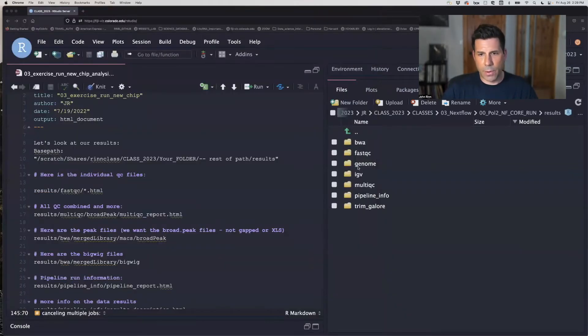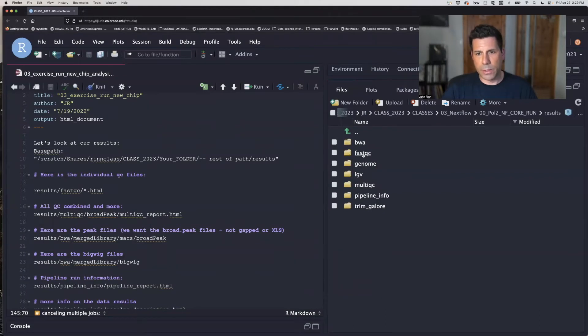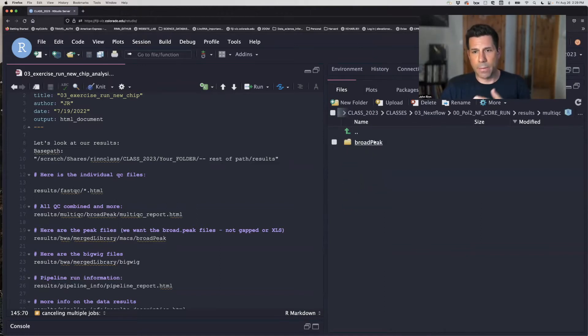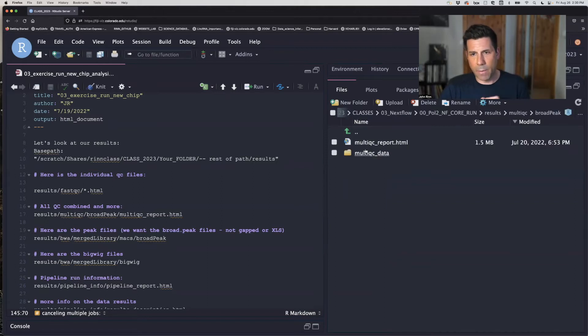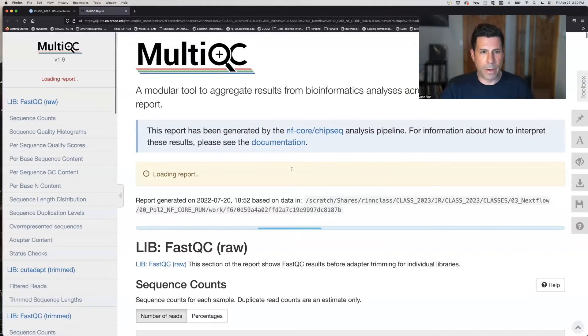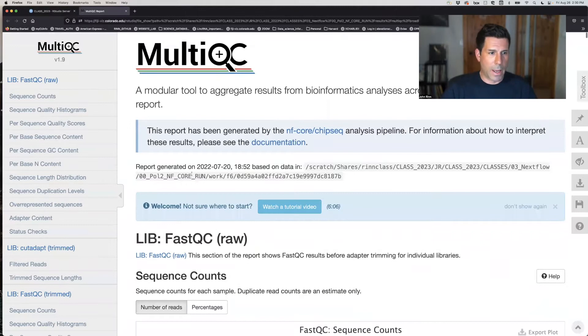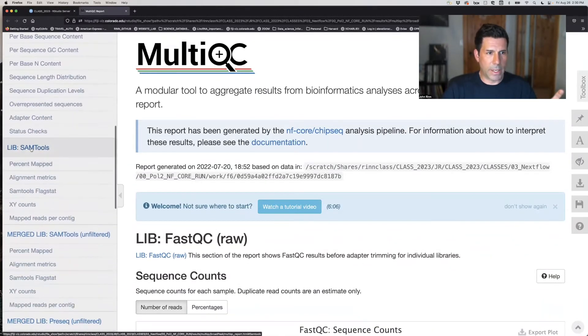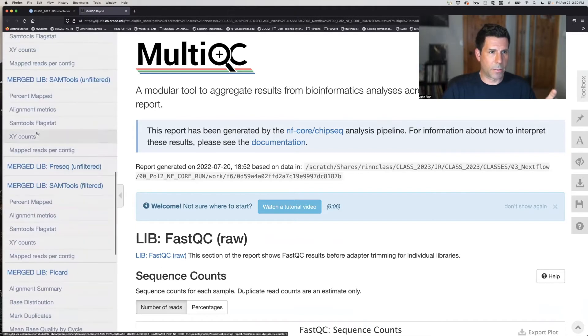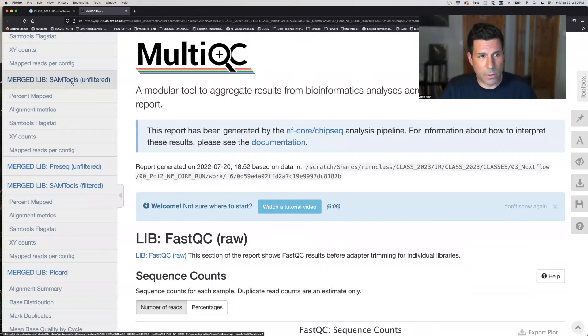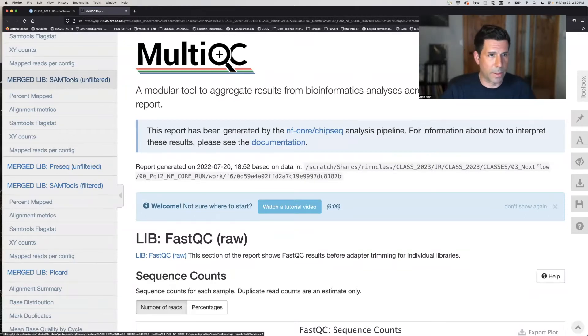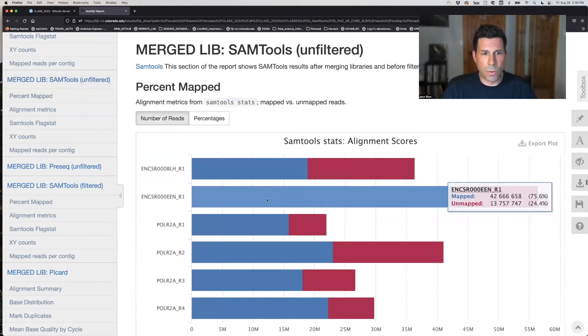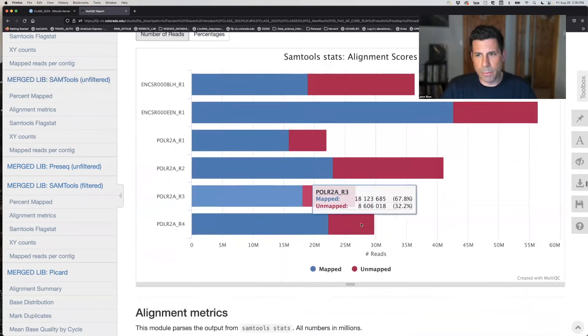So we're in our results folder, and the first one to go to is FastQC or the multi-QC. So this is the one that has all of your actual data of the thing we just looked at. Everybody's going to have a broad peak folder, and then you can click on this. You can either file transfer it to your computer, or it's on your computer, open it in a web browser.